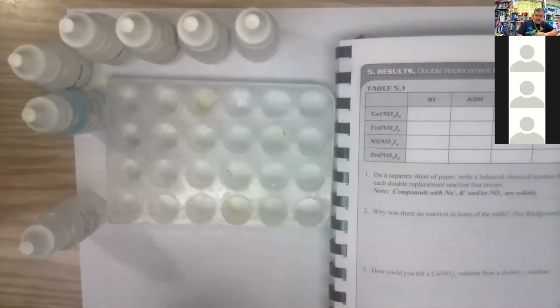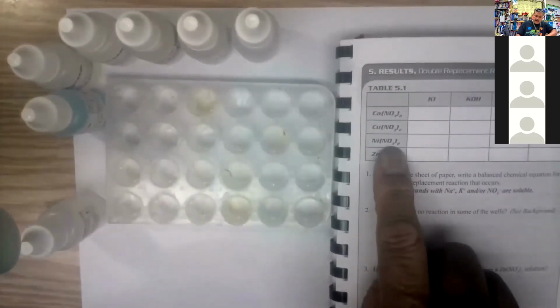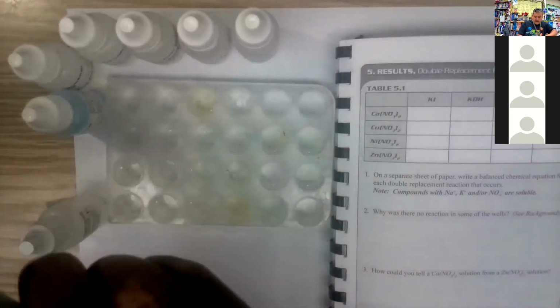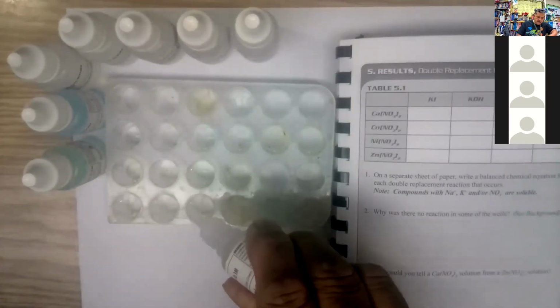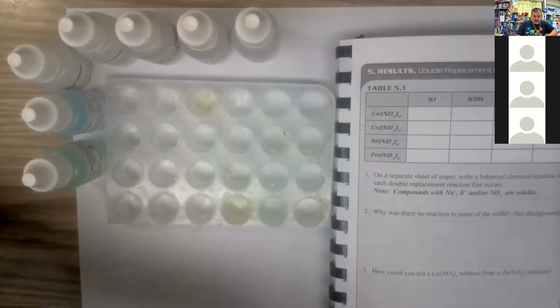All right. The third one is the nickel nitrate. That's right here. So I'm going to put 3 drops in each of the 4 wells going across. And then the last one is the zinc nitrate. So I'm going to take the zinc nitrate and do the same thing, 3 drops in each well. All righty.